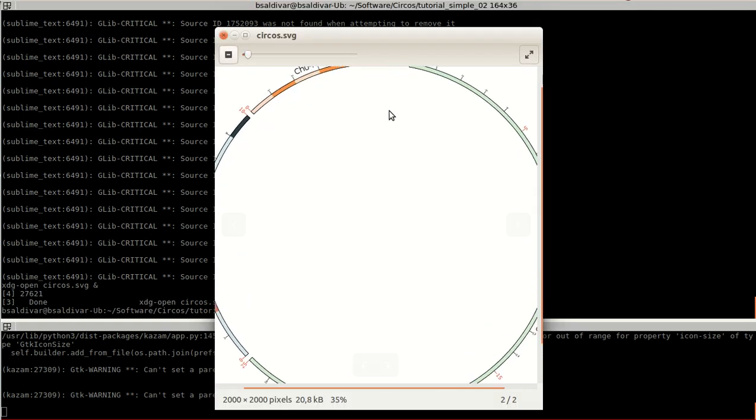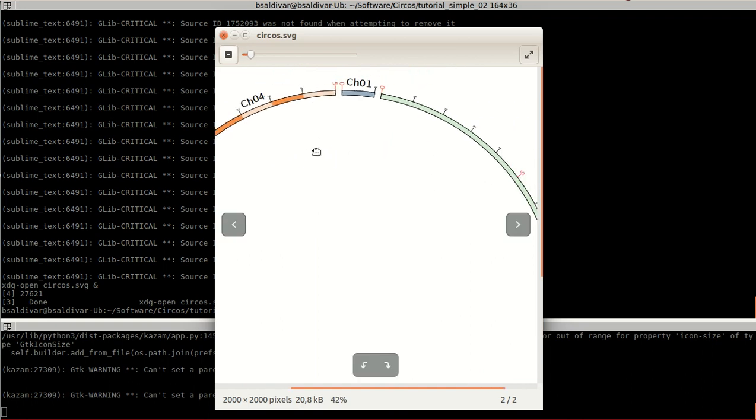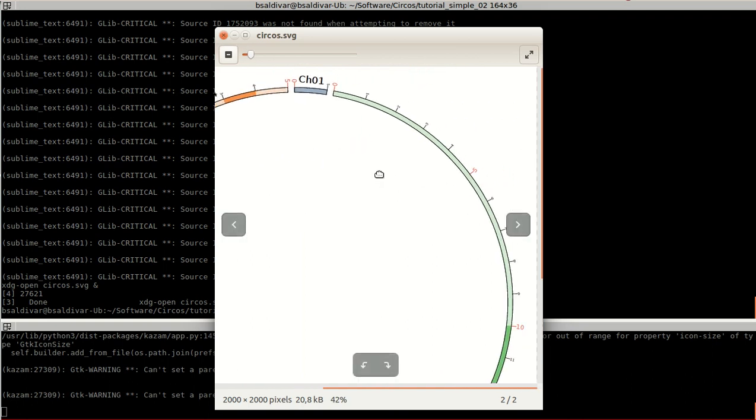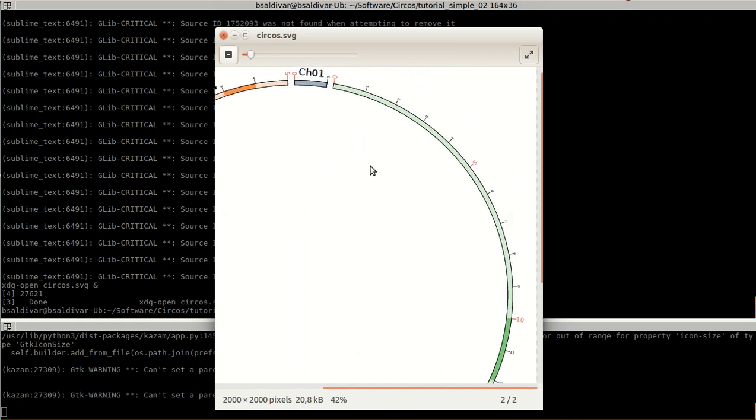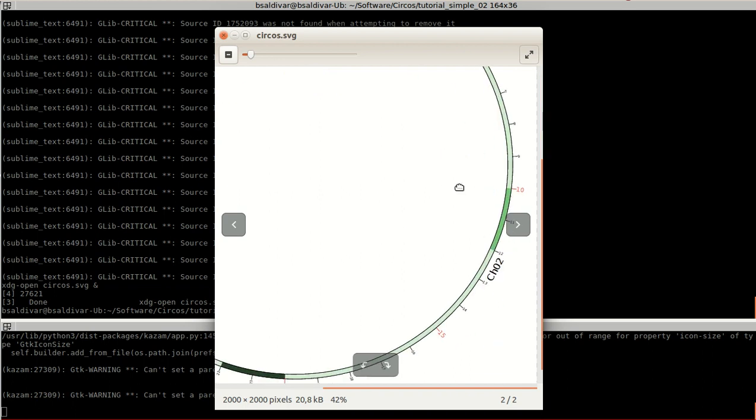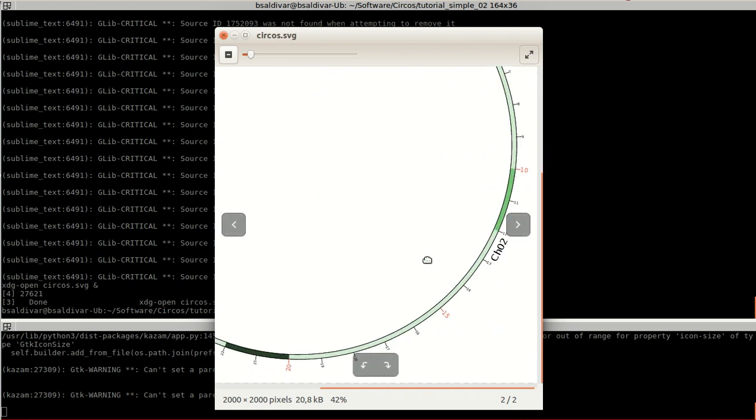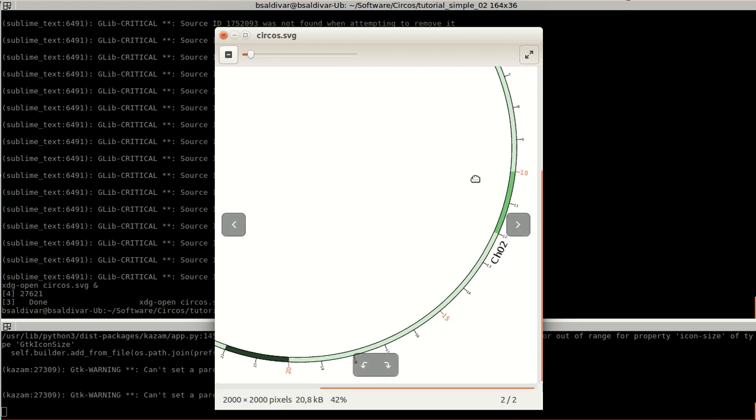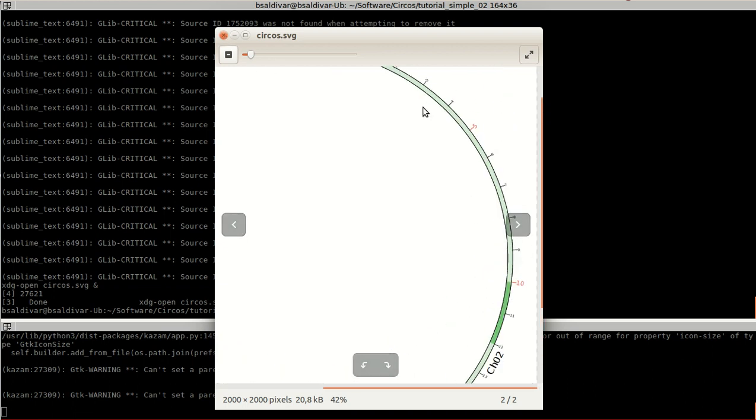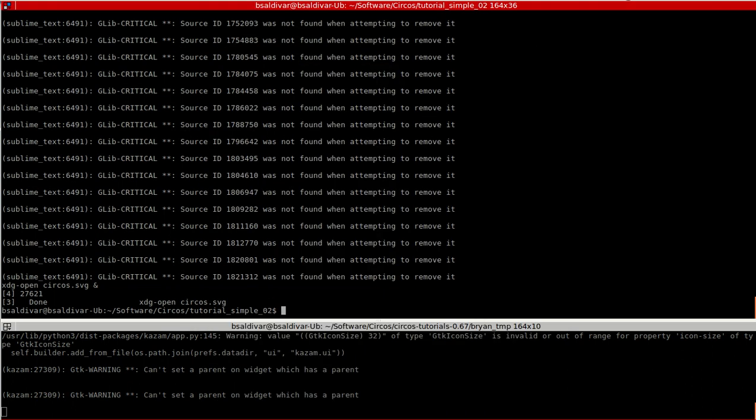Let's examine the part over here. Our karyotype one, or the two, you can see that it starts at zero. So this is a start tick. Then you can see that up to five, there appears a different color and size. Also in 10 and probably every multiple of five. And you can see that here, the numbers are increasing from zero, one, two, three, four, five.